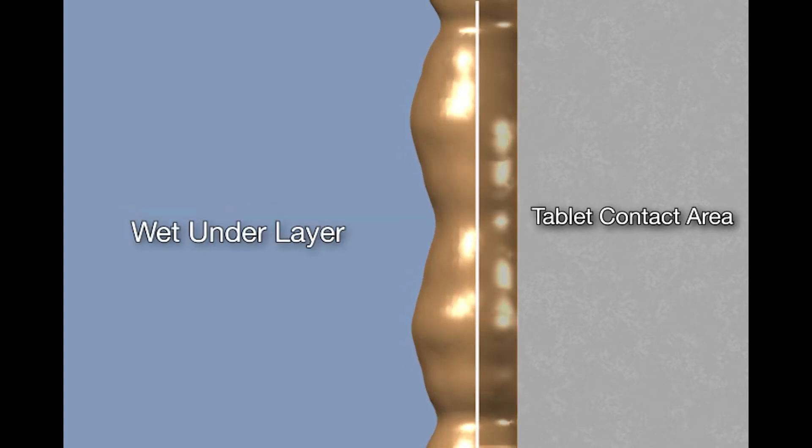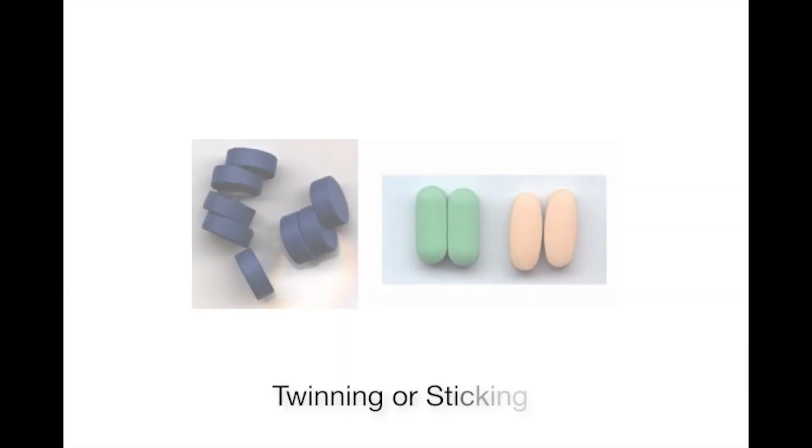Conversely, if evaporation is too slow, the surface layer will dry, leaving a wetter layer underneath causing twinning or sticking.